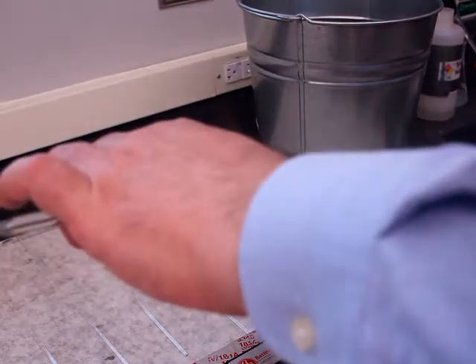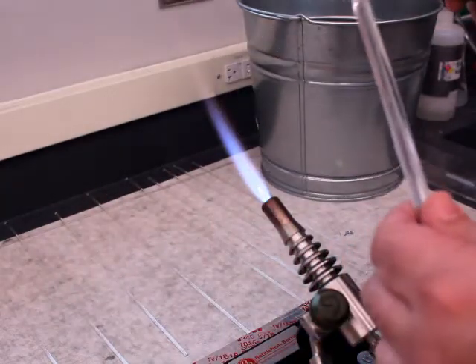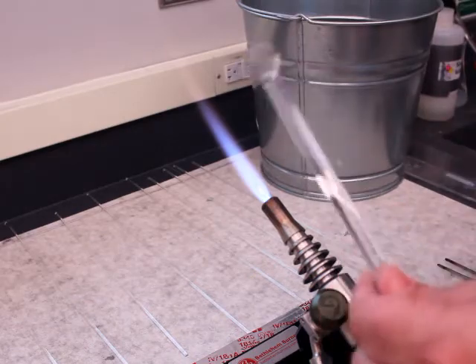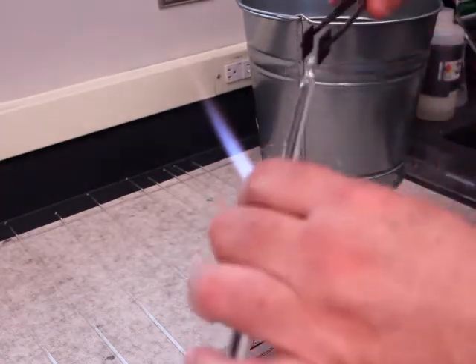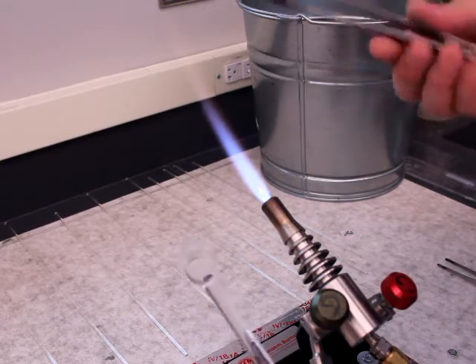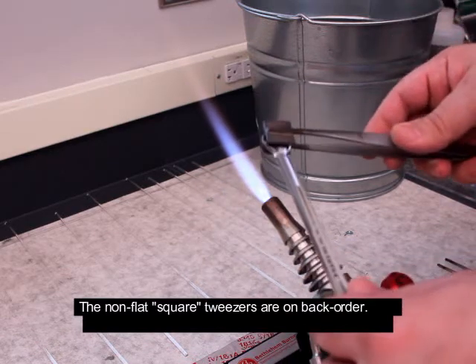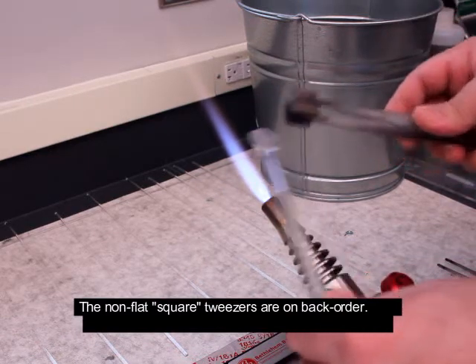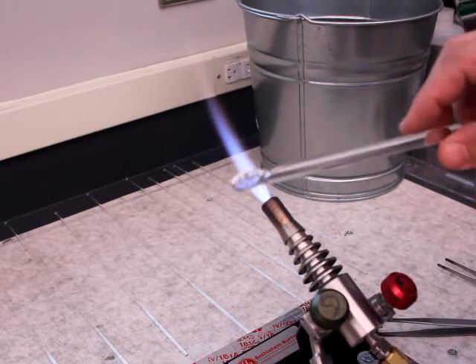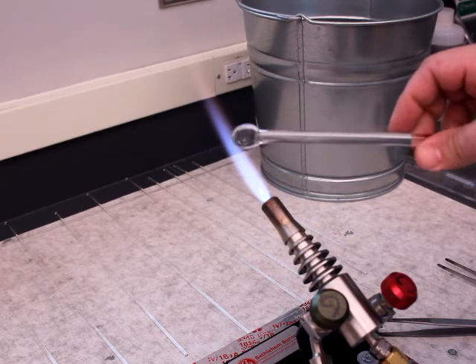I could go back in here and reheat this a little bit and get it a little bit better centered. But the key is, once you get your gatherer, you've got a nice ball of molten glass, and you can do a lot with it — just taking some tweezers that have these flat squares on them, these metal fittings on them, and then flatten it out. This can be the starting point of many different other types of glass structures.